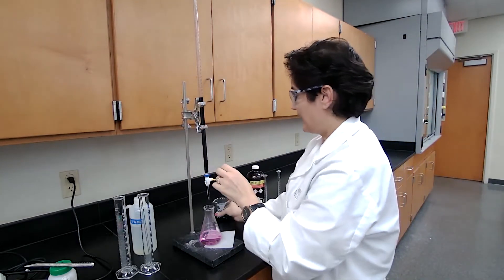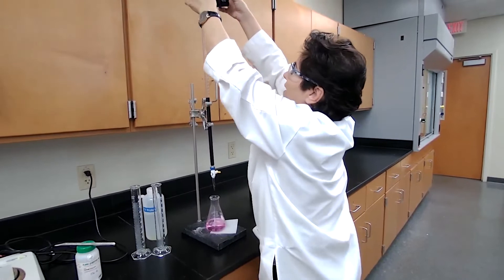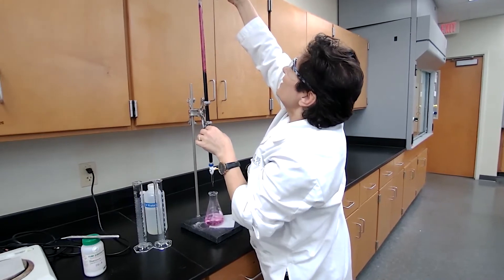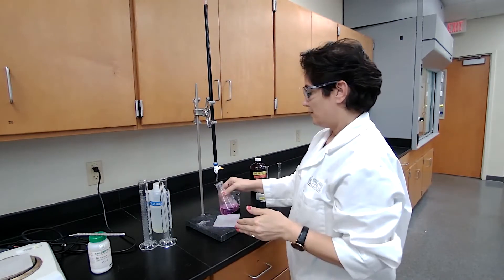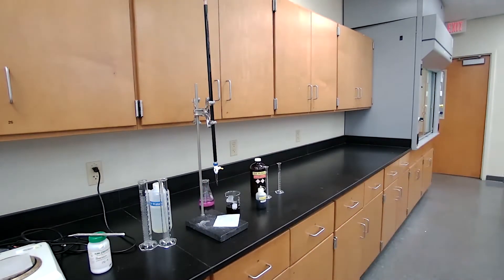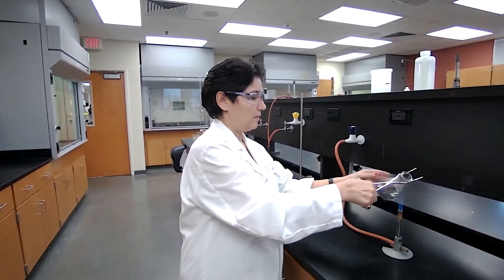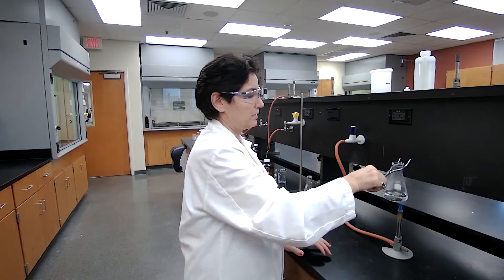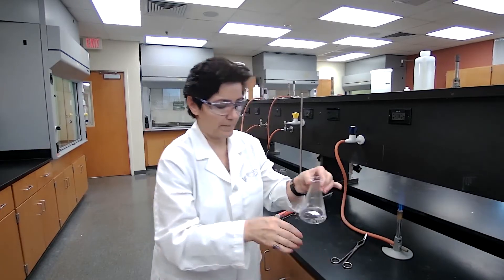For Trial 2, I'll heat up the solution and refill the buret to make sure I have enough solution. I'll bring it to zero — or maybe five — and adjust to zero. Record the initial buret reading for Trial 2 as 0.00. Now I'm going to heat up the Trial 2 solution. It's not supposed to boil, but it should be hot. It's starting to steam, so I can stop heating and start adding the permanganate.